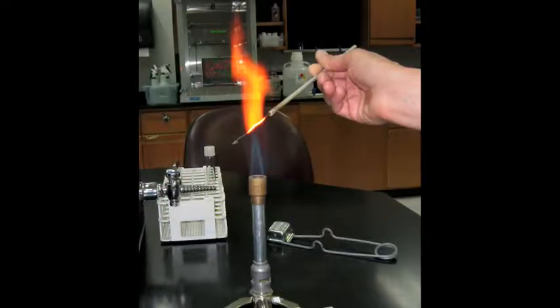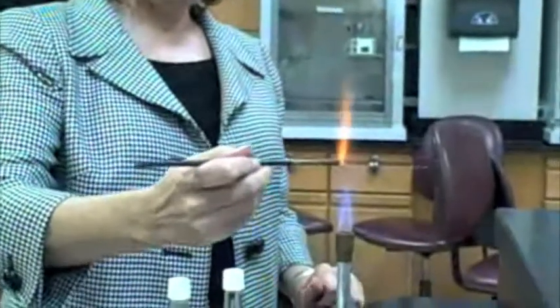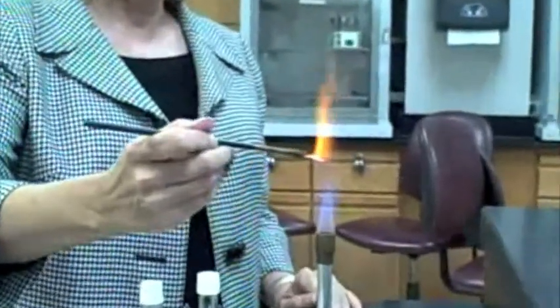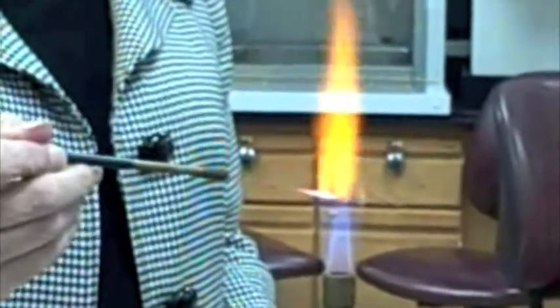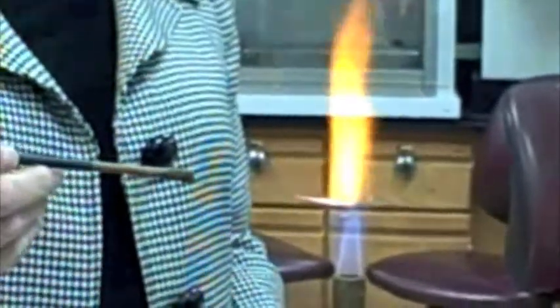First, you need to sterilize your inoculating loop by moving it through the flame. This should be done from the base of the loop all the way to the tip. It is most efficient to do this in the hottest part of the flame, namely the tip of the inner light blue flame. Be sure that the entire wire gets red hot.